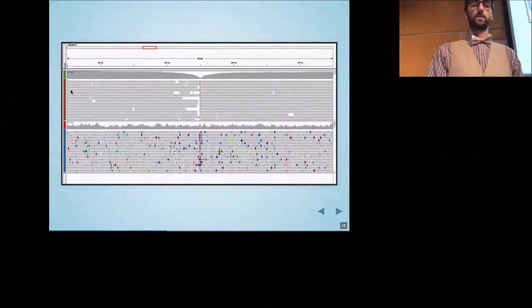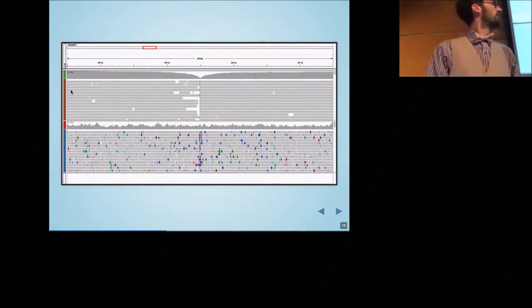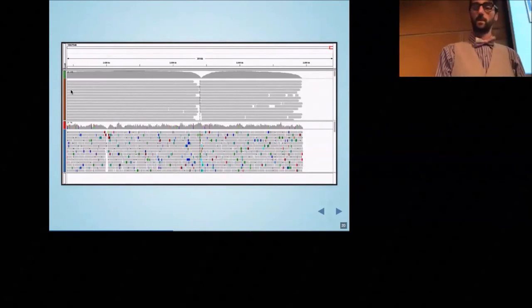Here's three misassemblies, and they all have this same pattern: big drop-off in physical molecule coverage at the location site of a misassembly. You can see how all the molecules start to stack up right there at the cursor in the middle, and that helps you identify the base pair accurate coordinate where that misassembly is.